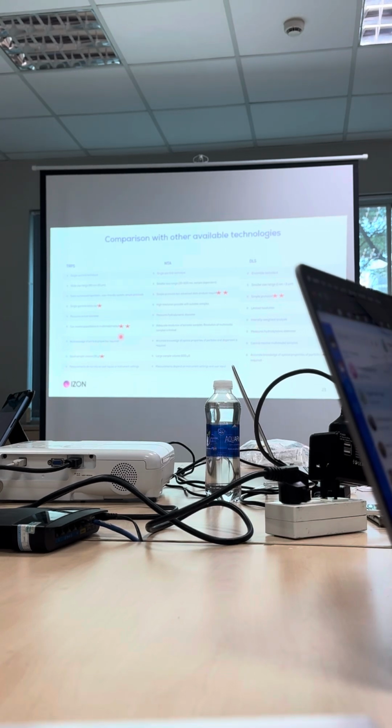This is very important. If your samples are multimode, optical methods may not distinguish that. TRPS can do that. I can send you these slides later, if you need. And for NTA, you see the drawbacks, the large volume.